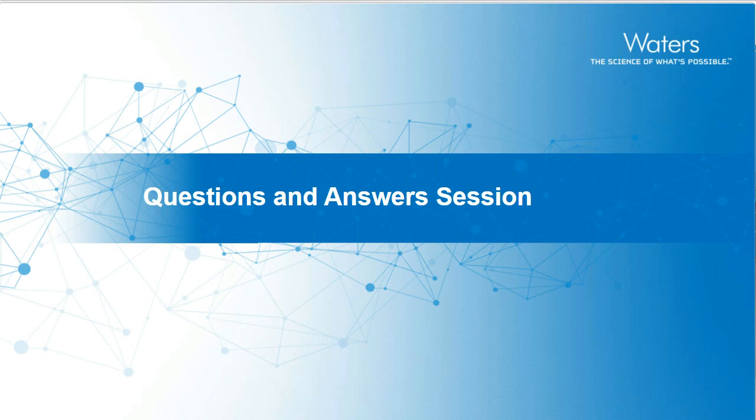Okay, thank you for that, Emily. Another question on the RADIAN. Can you access the raw mass spec data? Yes, you can open that up through MassLynx.